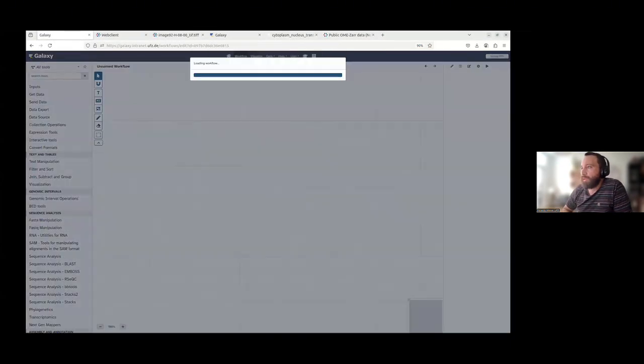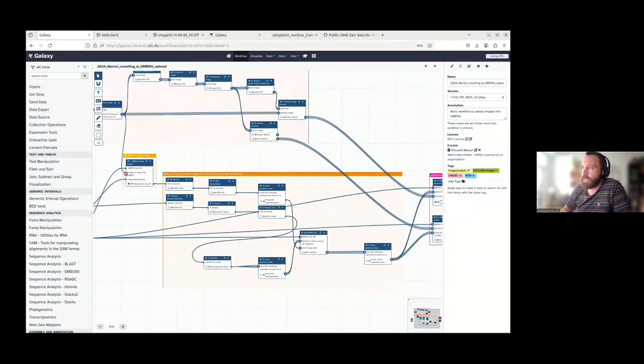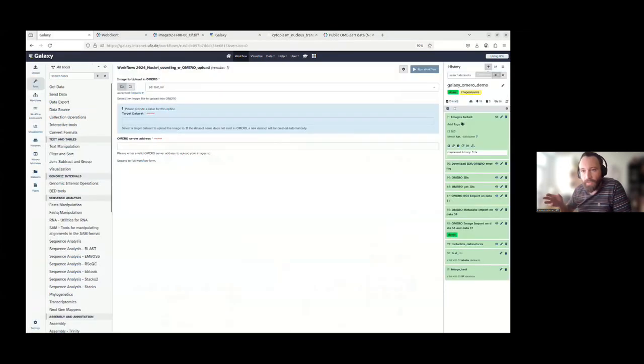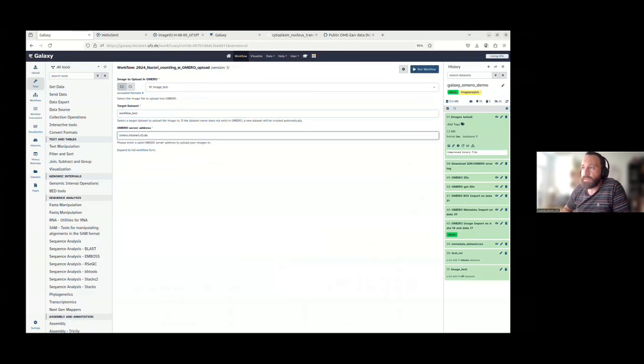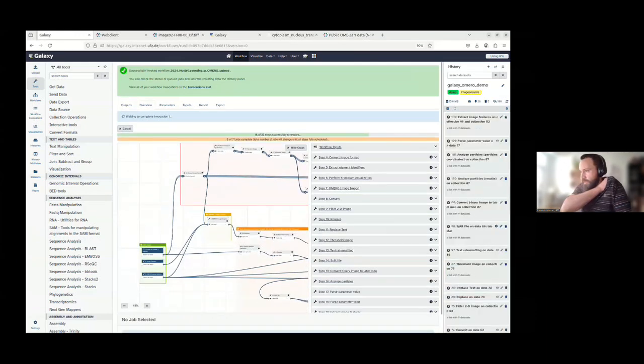Then, to show that this can be applied to a workflow, this is a nice workflow because you have three inputs: the images, the dataset, and the Omero server. You have a huge step, the red one, that is just image processing, basically doing the steps that Leonid showed before. This workflow automatically uploads the image in Omero, performs all the analysis, and then uploads the result into Omero directly. I have to put the images as input, the target dataset, and the Omero server address, and I just start it. Now it will start the full workflow in one run.